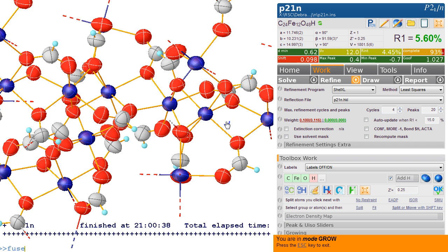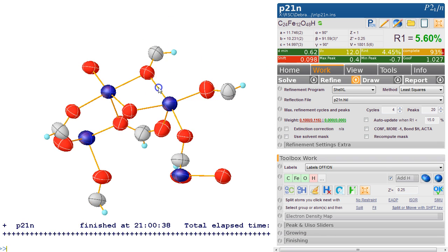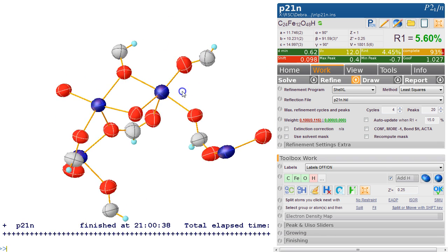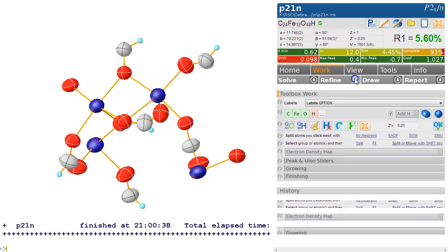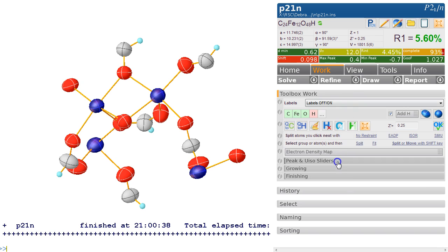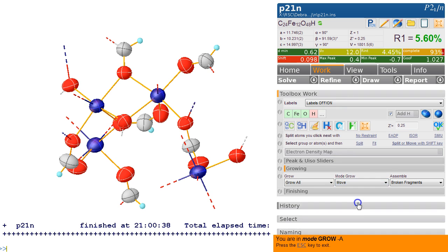If you type 'fuse' again, we go back to the asymmetric unit. We might want to tidy this up because this is clearly another one of those formates, probably this one. What we can do here is go to the growing area and go 'mode grow' and then 'move'.